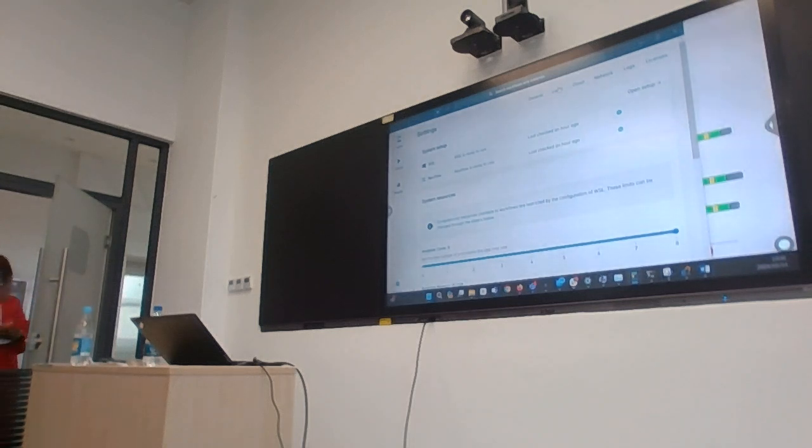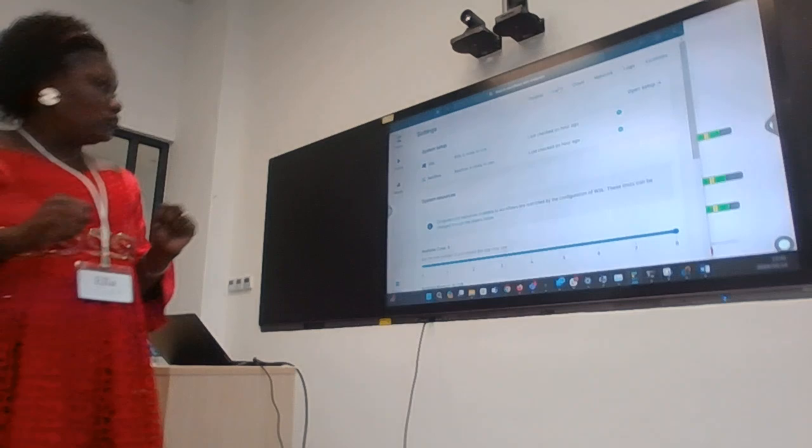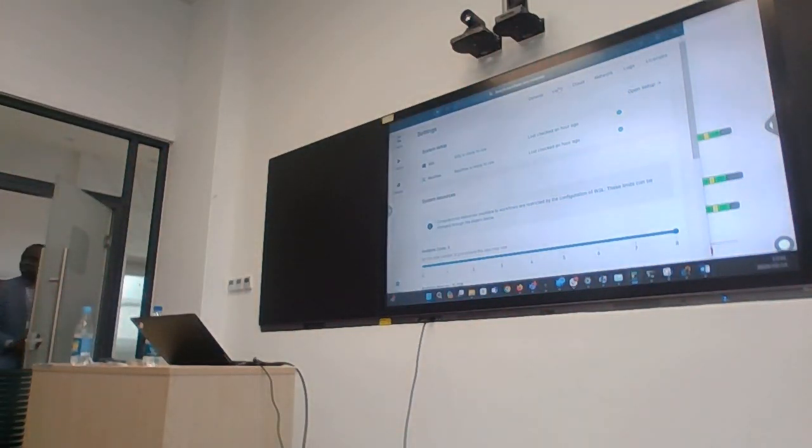Okay, so great. But it's still saying it's too old. I'll come back. C'est très ancien, on va faire une mise à jour. But when you go to update, it says to reboot. We just rebooted, and it says we must reboot again. I don't understand. But anyway, we deal with the Docker first.